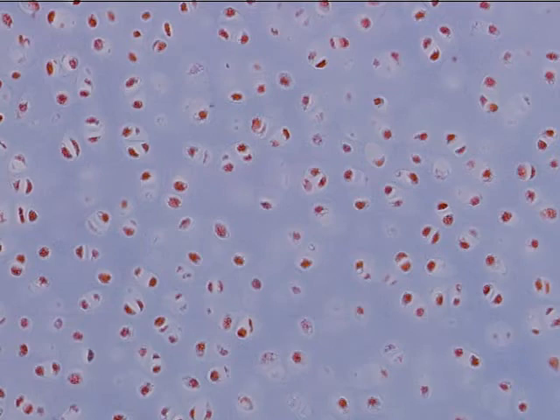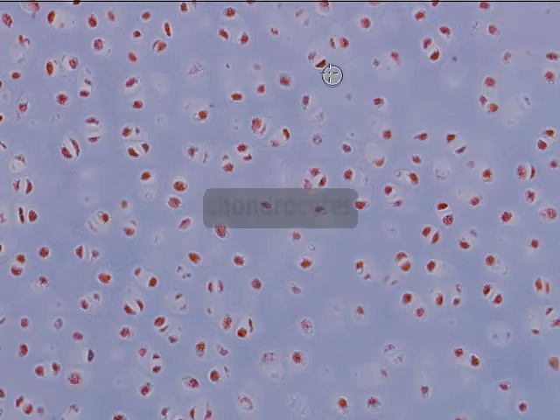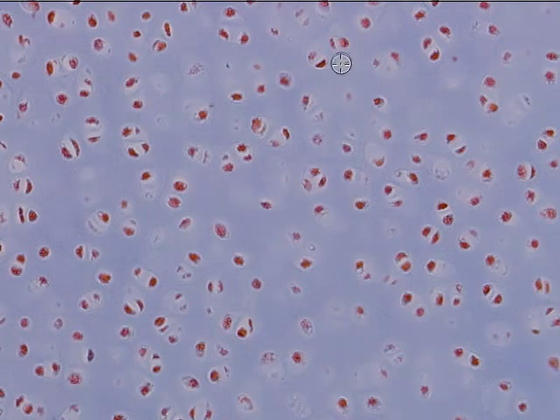This cartilage has a thicker jelly-like matrix, and that's the bluish, whitish regions here where we see the chondrocytes in the reddish stain scattered pretty evenly. It's an even distribution of chondrocyte cells to matrix. That's one of the key features to look for when you're deciding what type of cartilage you have. It is the quantity of matrix relative to the distribution of the chondrocyte cells.